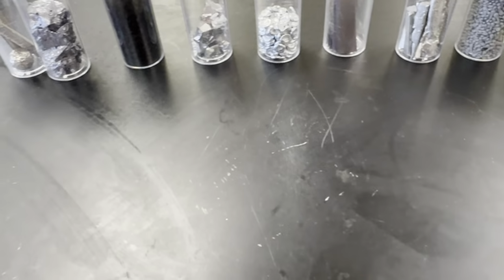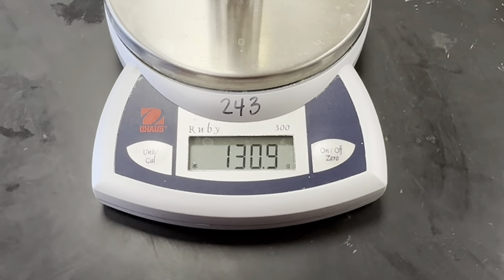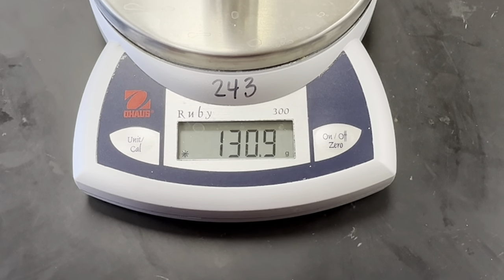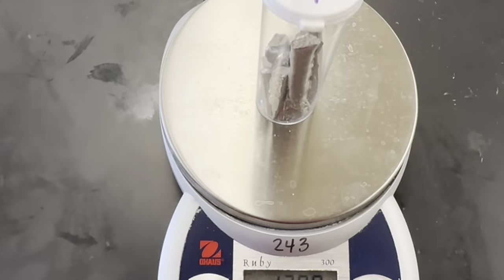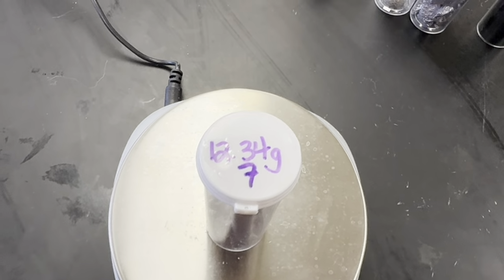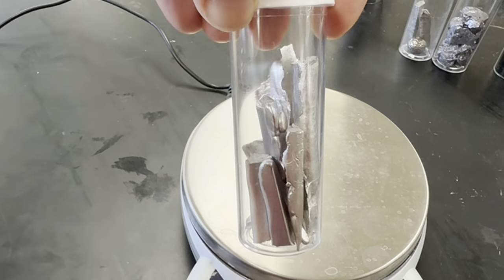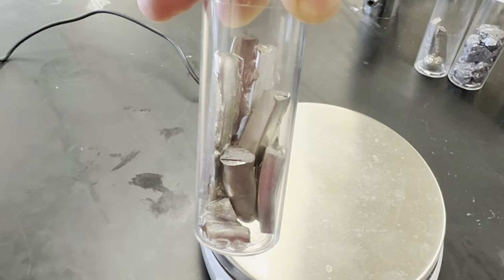Number 7, 130.9 grams. And the container has a mass of 12.34 grams. And inside, that's what it looks like.